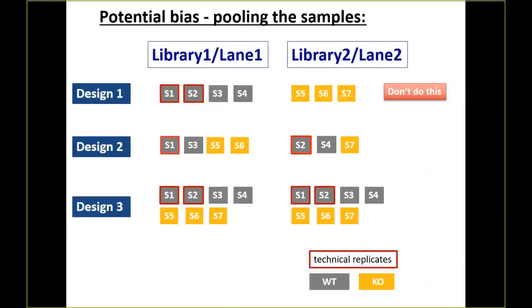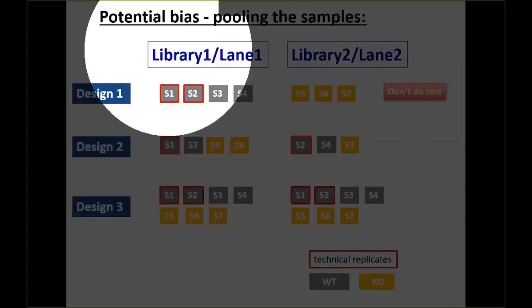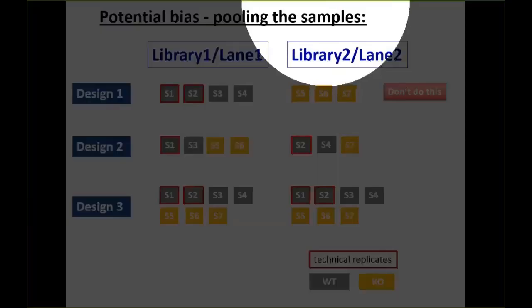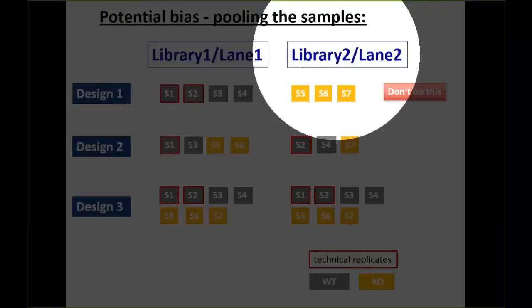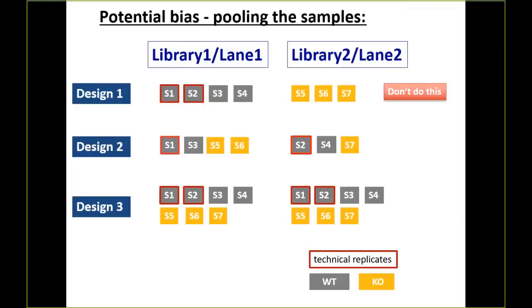All right, so going back to this, there's a couple of experimental designs here, designs 1, 2, and 3. Obviously, we're talking about potential biases here. So potential design number 1, lane 1 gets all the black mice, lane 2 gets all the tan mice. Don't do this. Can anybody see the problems inherent in this approach? This is a case where, again, you want to ask, what happens if one of the technicians in Illumina sneezed into my flow cell?